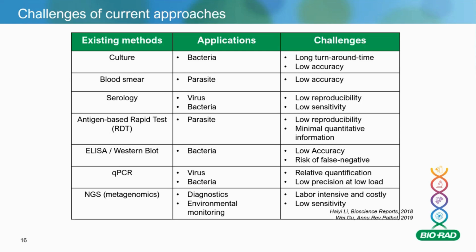And you've got the one that has become very popular in more recent times, which is NGS, your needle in a haystack challenge, as we discussed earlier, because the metagenomics data that you can get is a lot, but much of it is quite irrelevant, especially when you're looking at pathogens. A lot of it is human or host DNA or RNA, when you're really only looking for a tiny, tiny needle in the haystack.